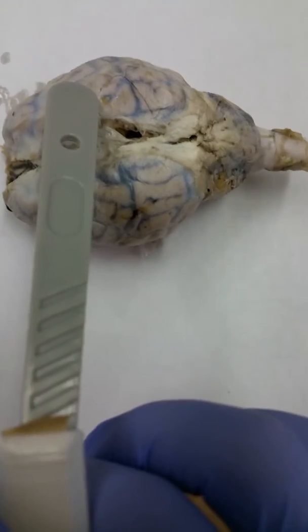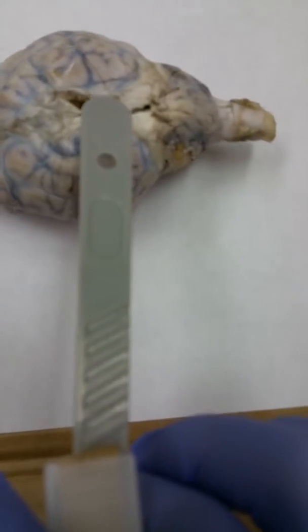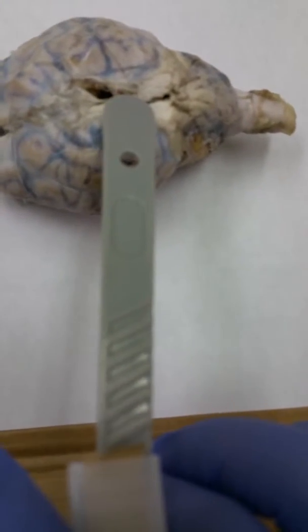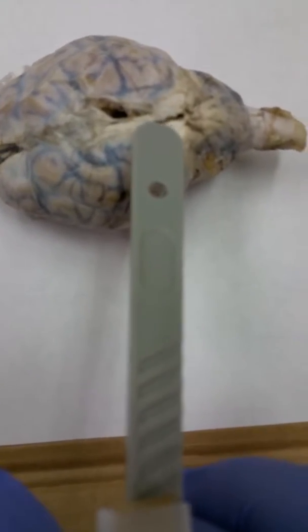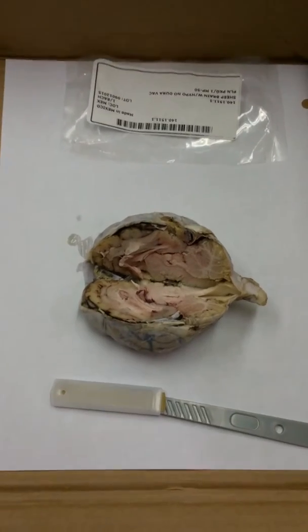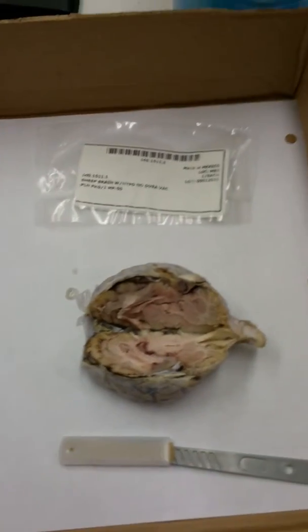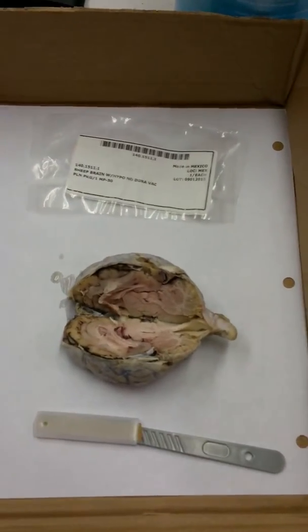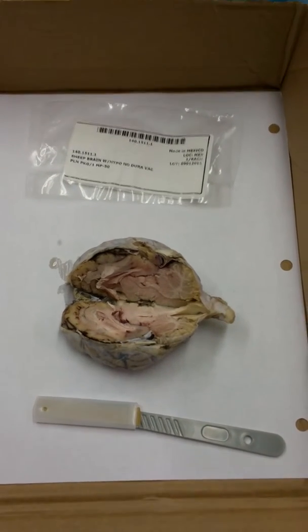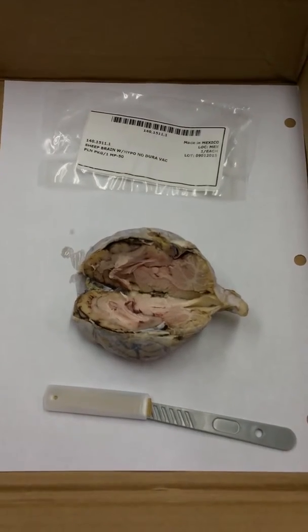Obviously, you can't see the details until later on when we are able to dissect it. The optic chiasm, and see that little indentation right there? You just move down a little bit and you'll be able to get the pituitary gland. So during the brief intermission, we were able to dissect the brain, and that's the whole function of this lab, to do a sheep brain dissection.